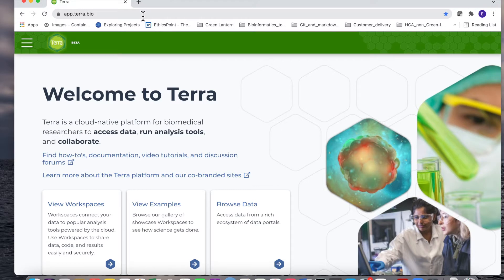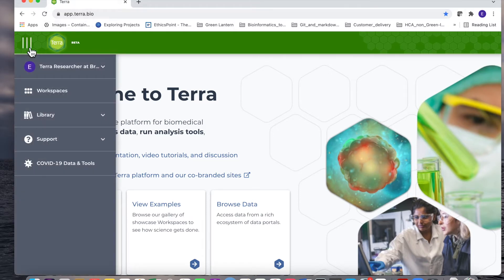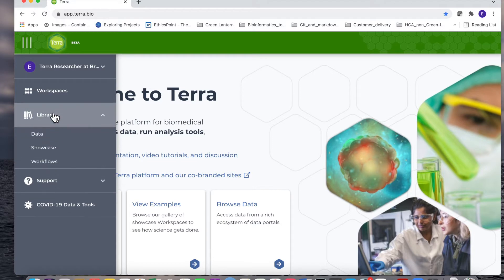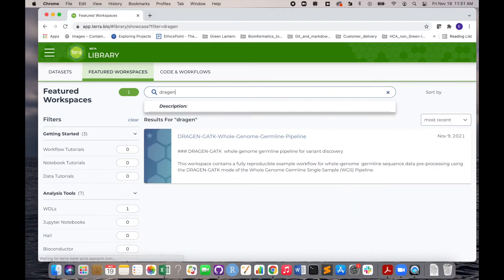To find the workspace, first navigate to app.terra.bio and log in with the email you used to register for Terra. From the Terra main menu, select the library drop-down and then choose the showcase section. In the search bar, type DRAGEN, which will return the featured workspace. Select the workspace to open it.